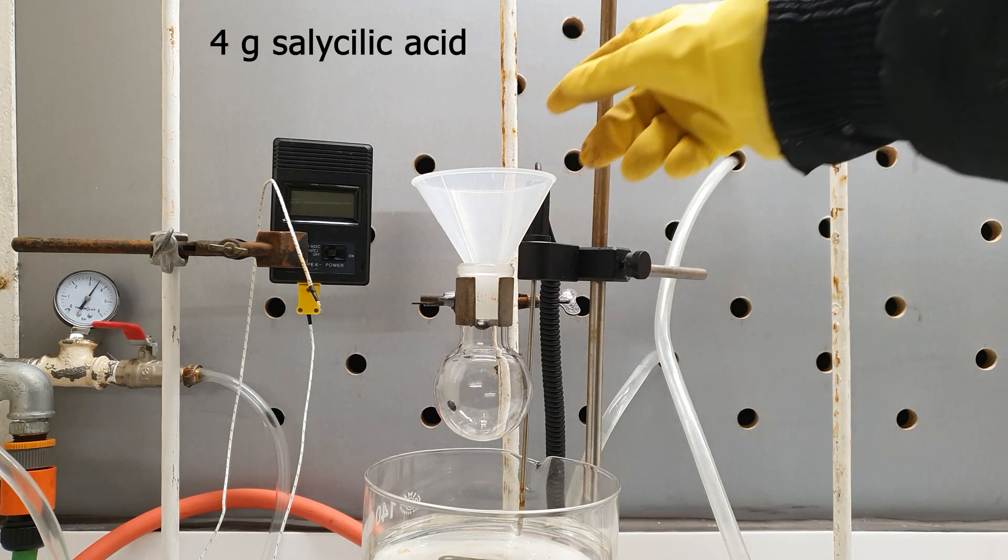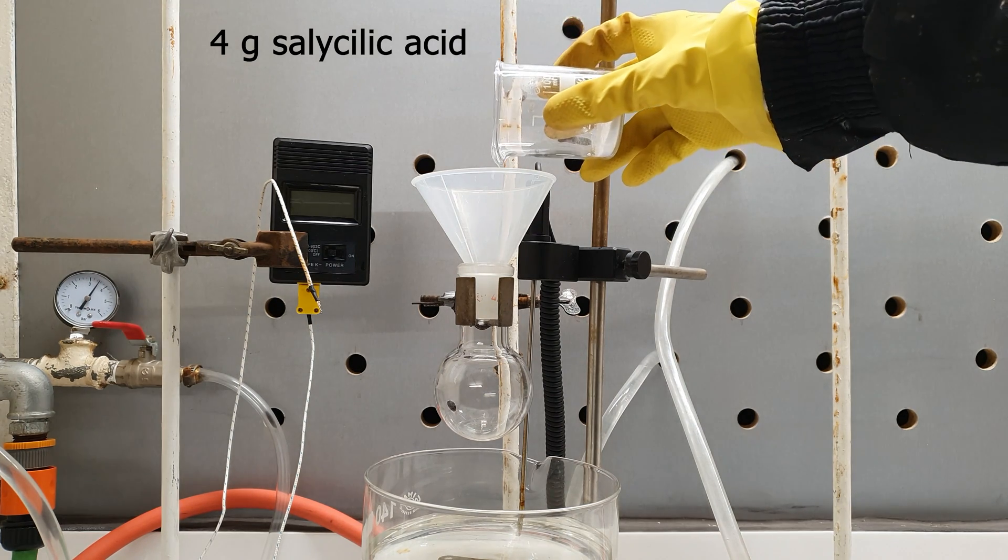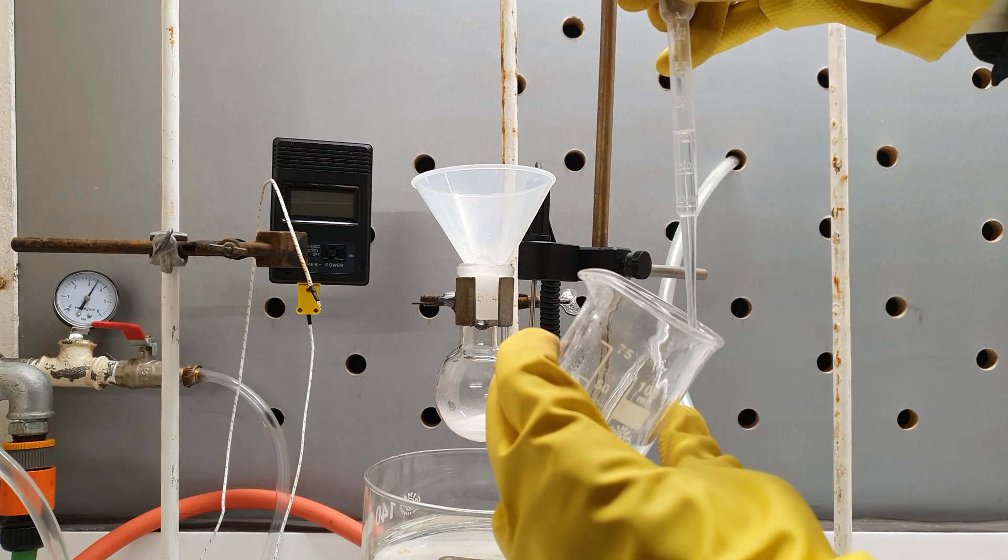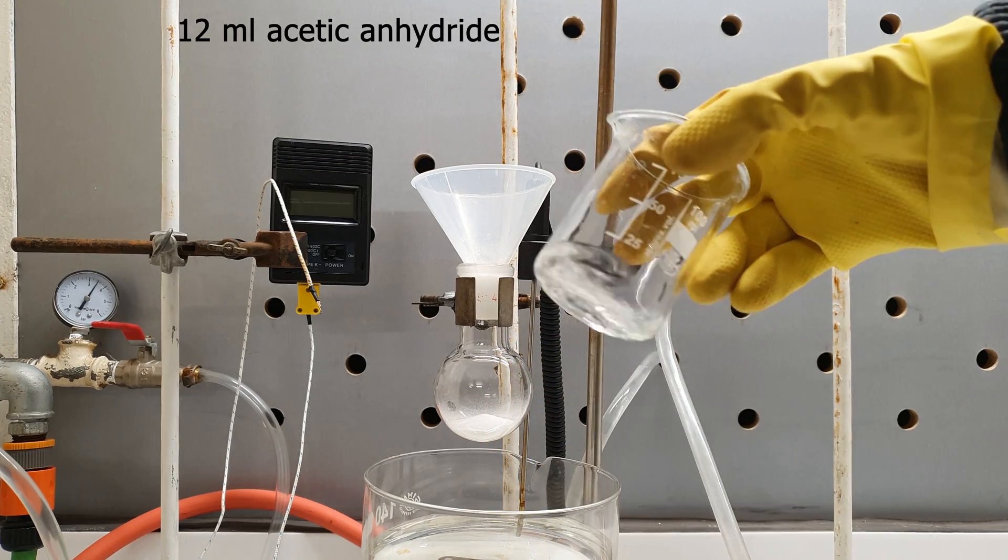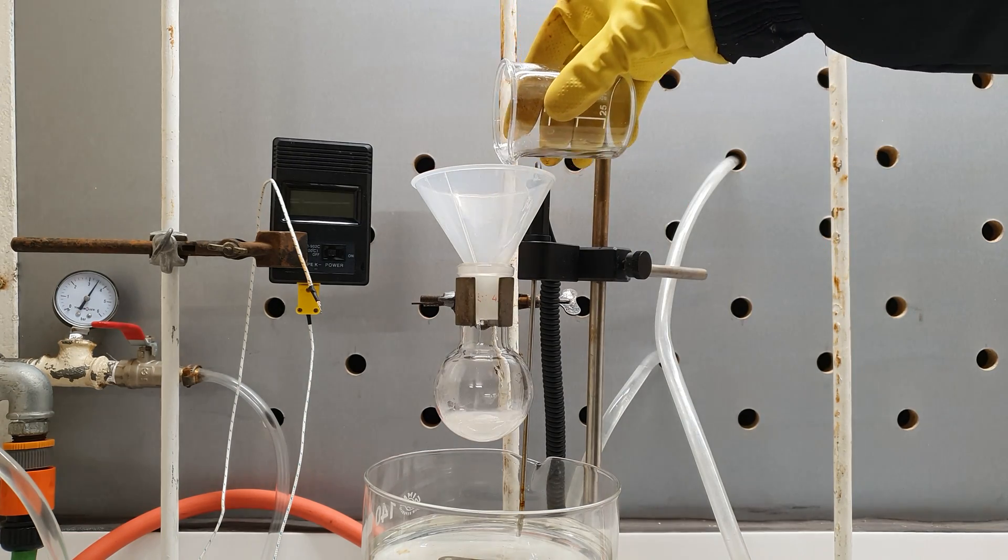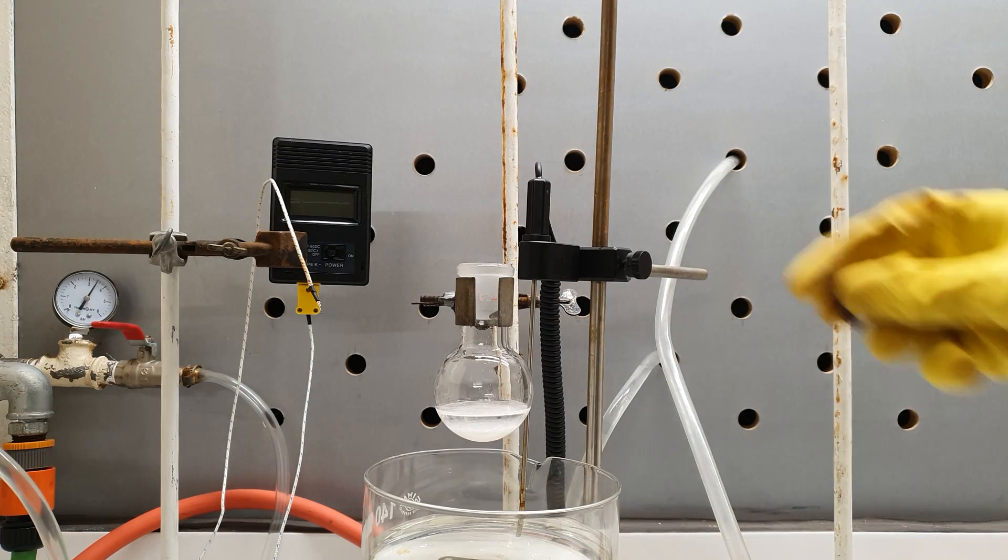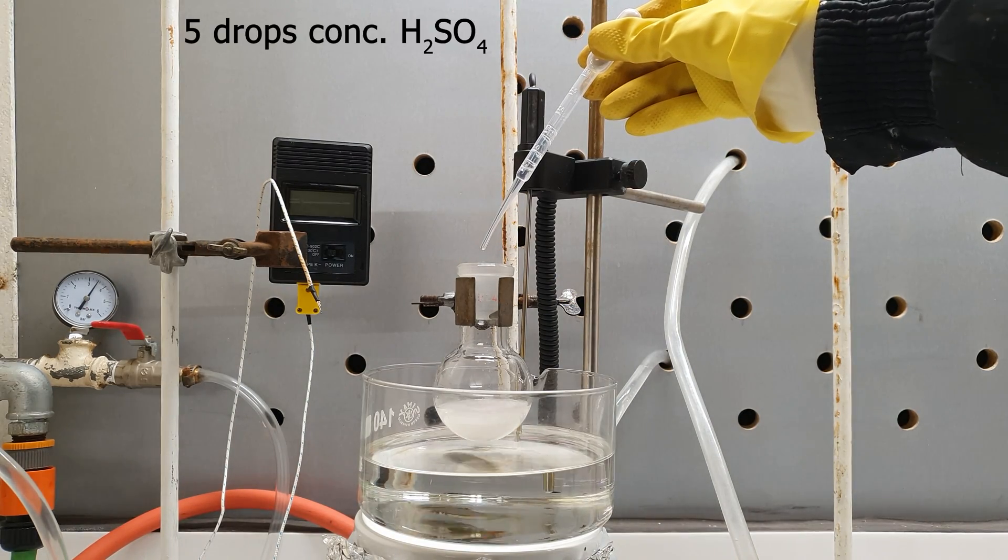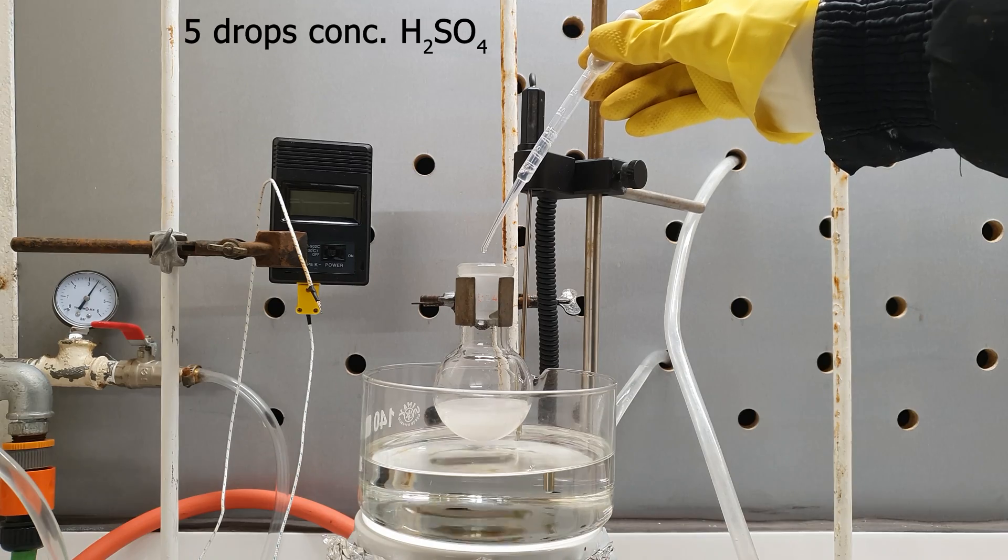I added 4 grams of the salicylic acid to a 100ml round bottom flask. This was followed by 12ml of acetic anhydride which I used to wash the beaker and the funnel from any remaining acid. Then I added a stir bar and under vigorous stirring I added 5 drops of concentrated sulfuric acid.